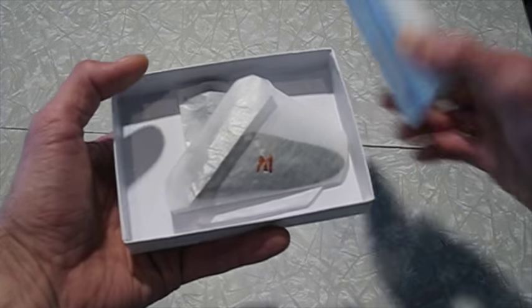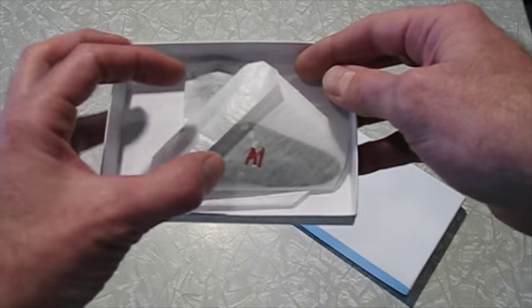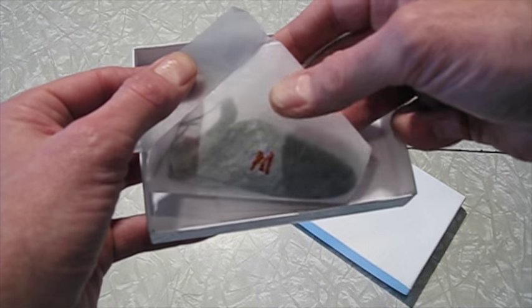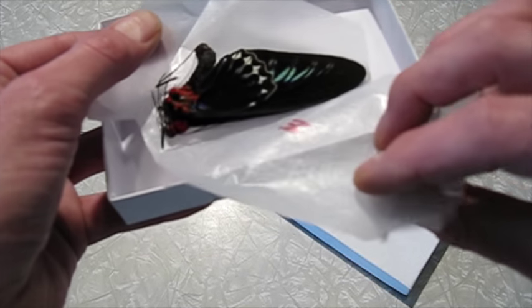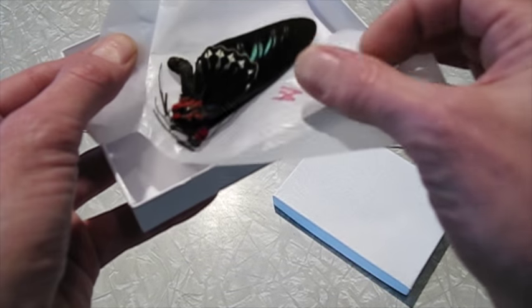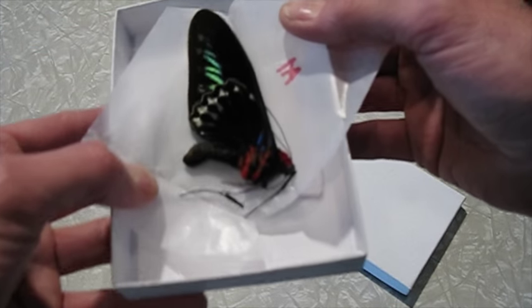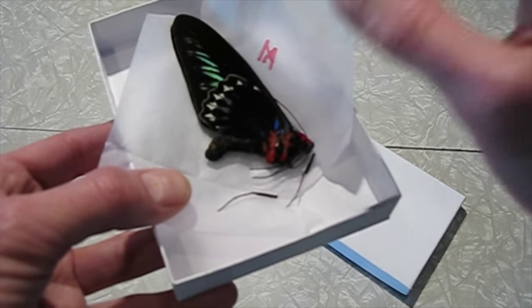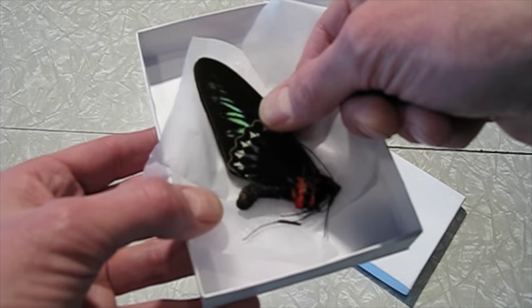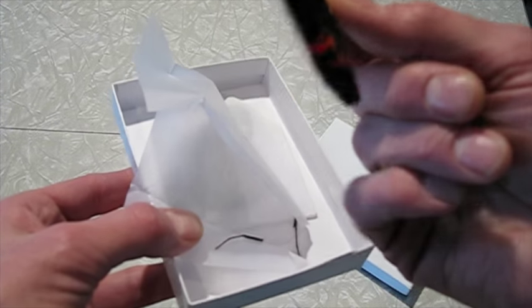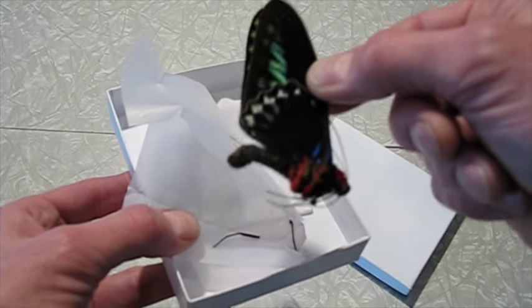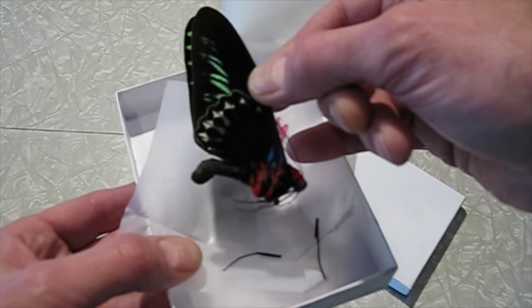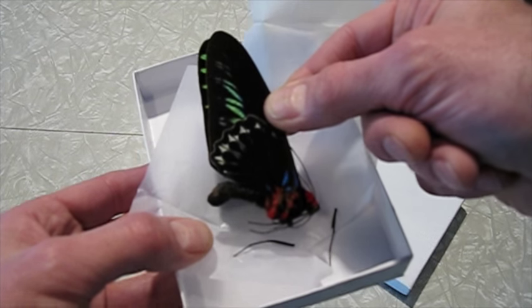In this video I'm going to demonstrate how to relax and pin dried butterflies. I'm going to use this pair of Raja Brooke's birdwings, Trogonoptera. These are from the Indo-Australian region. They're protected, all the birdwings are protected, but they're raised on farms so it's actually a good thing.